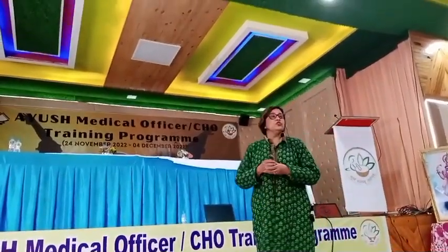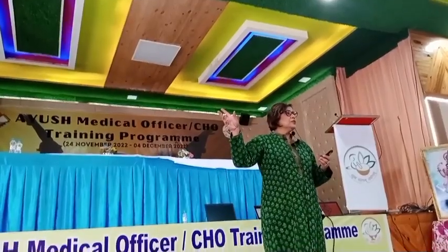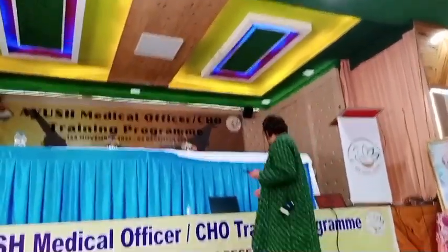So this is a centrifuge. Do you want to see how the centrifuge works? I can run that.